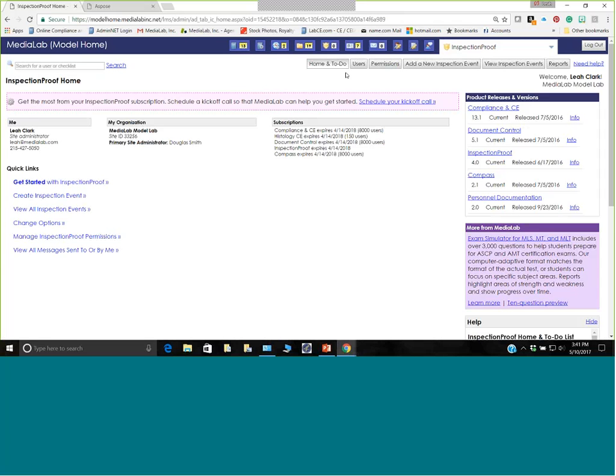We are part of CAP's checklist distribution program. We're the only one in the US that has that designation right now, and you can check us out on their website too. So I'm going to go ahead and make an inspection event with you right now.